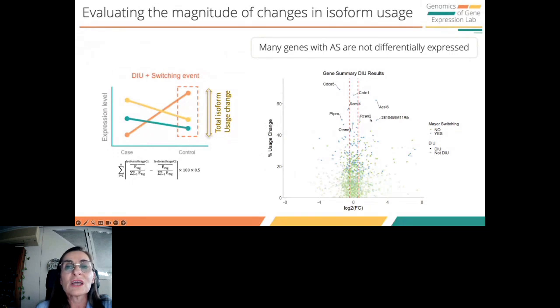versus the change in the isoform usage. That gives us an indication of how genes are regulated, by differential gene expression or differential isoform usage. You can see that there are many genes that have big changes in expression level, but not at the isoform level. But there are some other cases, for example this gene here, that has actually no change at all at the gene level, however, it has huge changes in the utilization of alternative isoforms. So you can see how genes are differentially regulated.